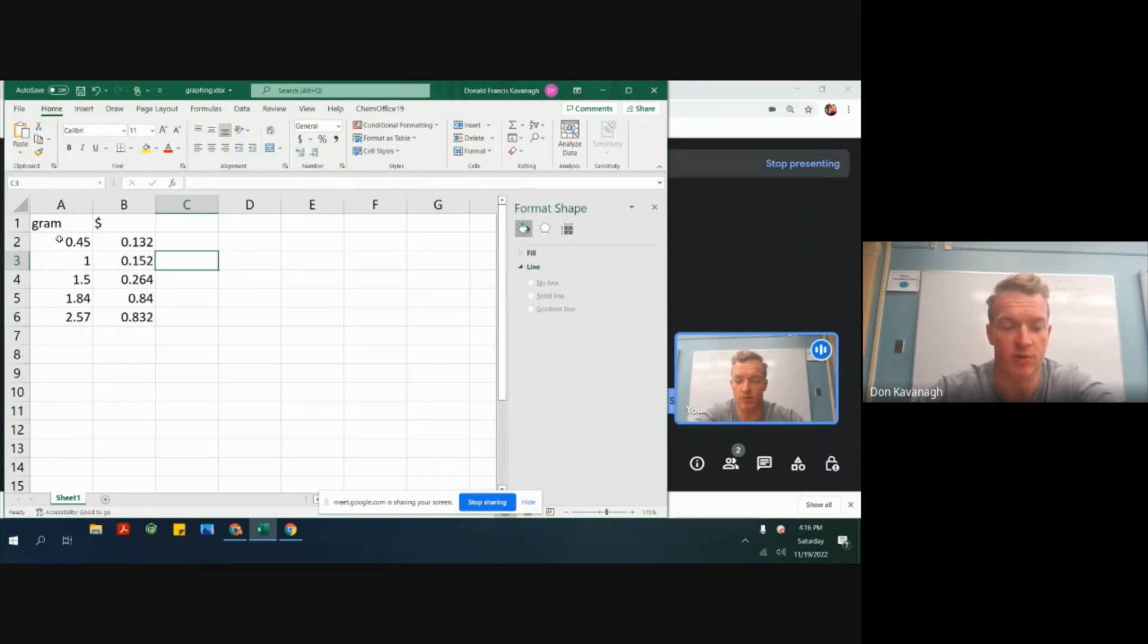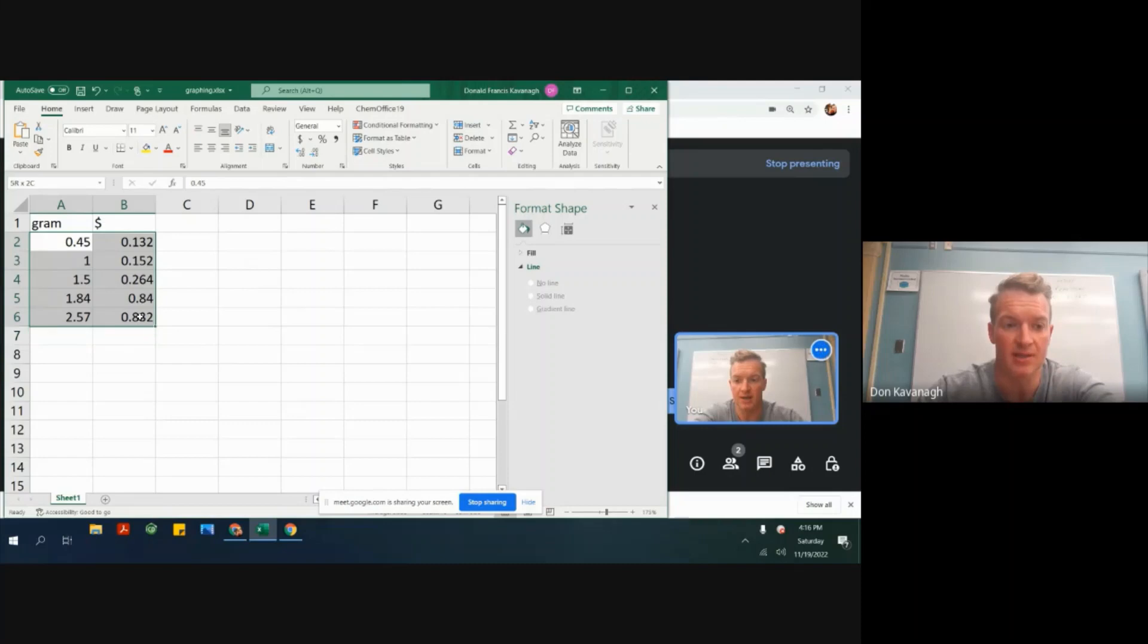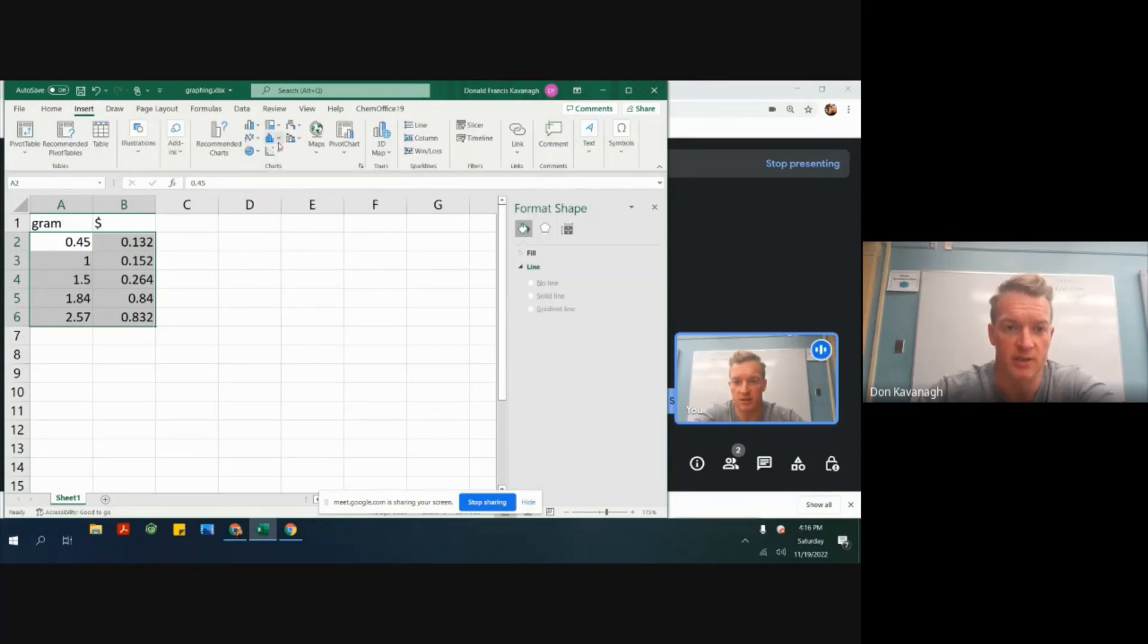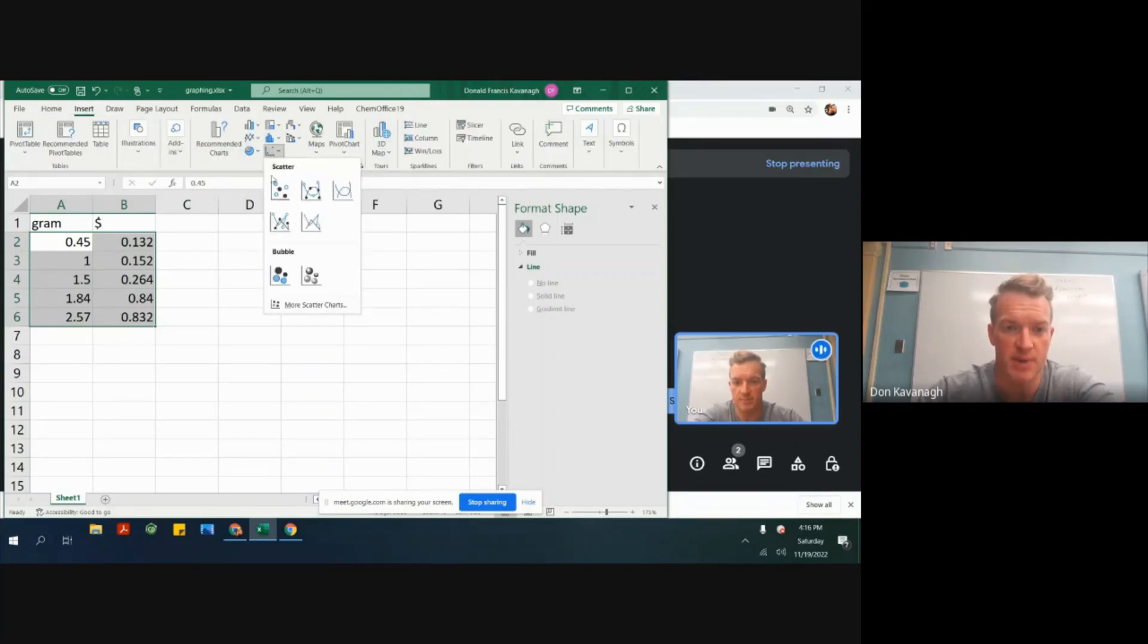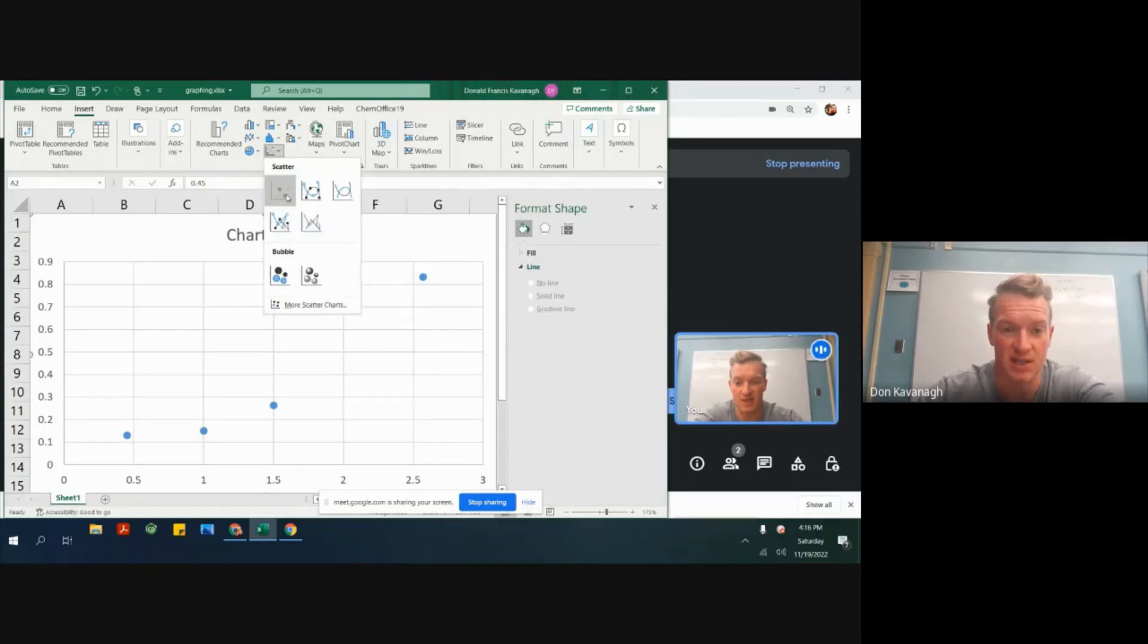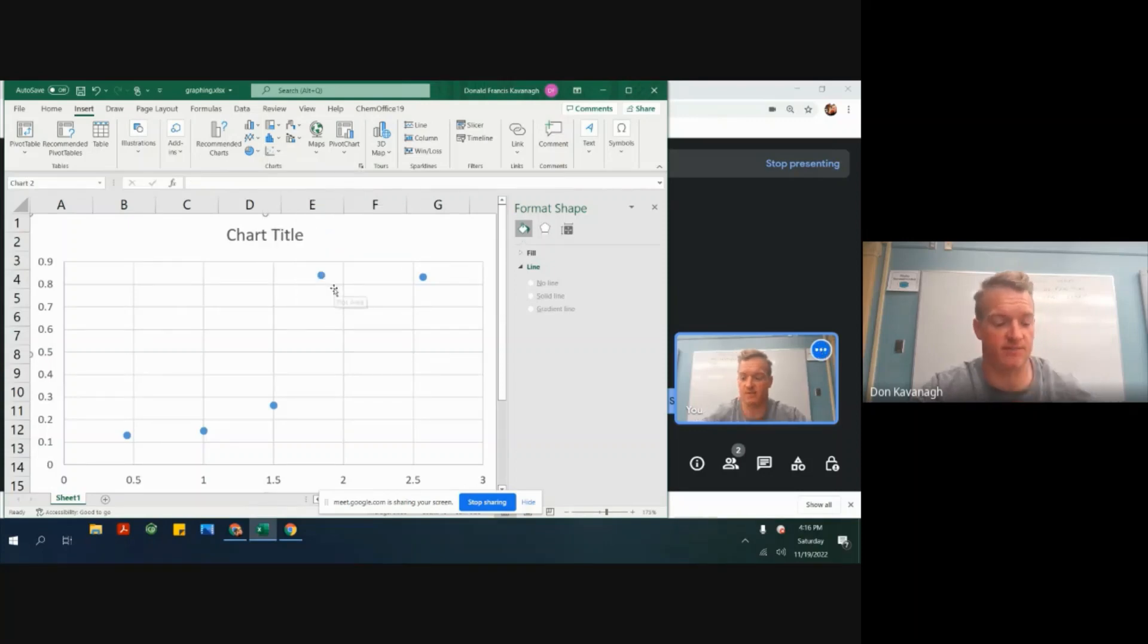Right now I want to focus on the creation of the scatterplot. Highlight the cells, no units in here, just numbers. Go to insert and then find the scatterplot shotgun blast pattern up here. We want to pick the one that doesn't contain any lines connected.